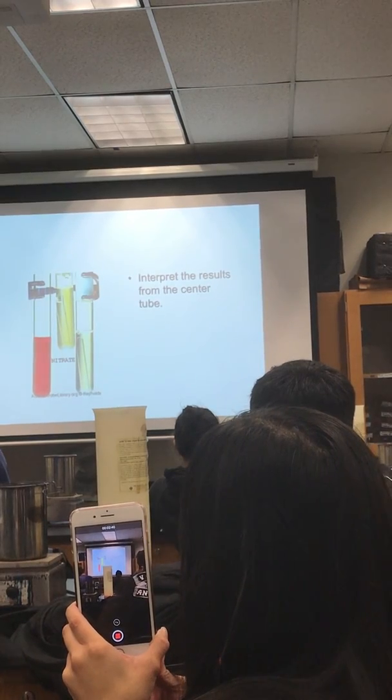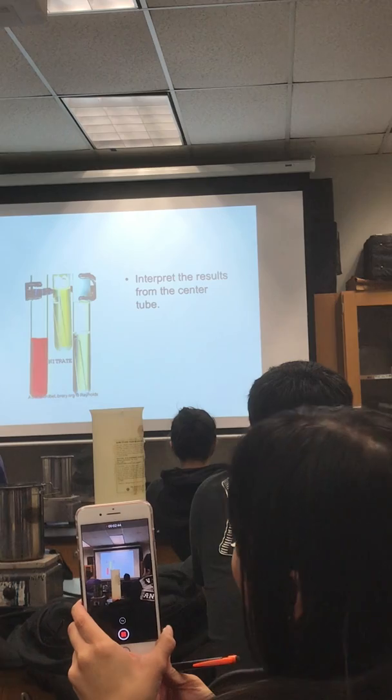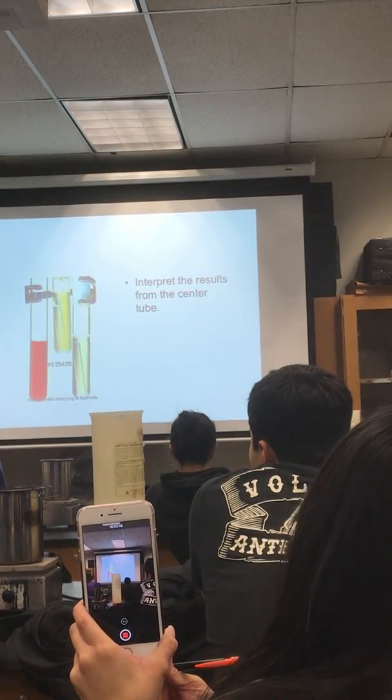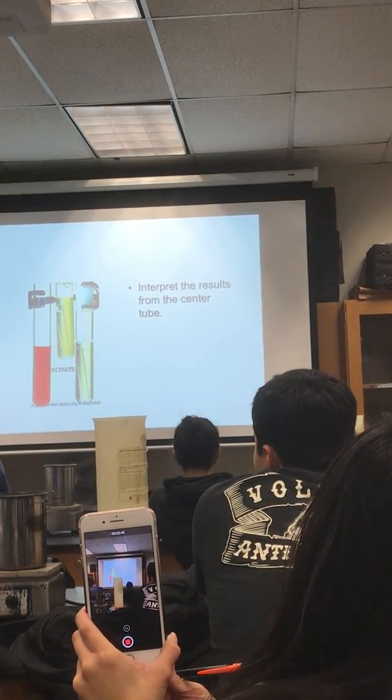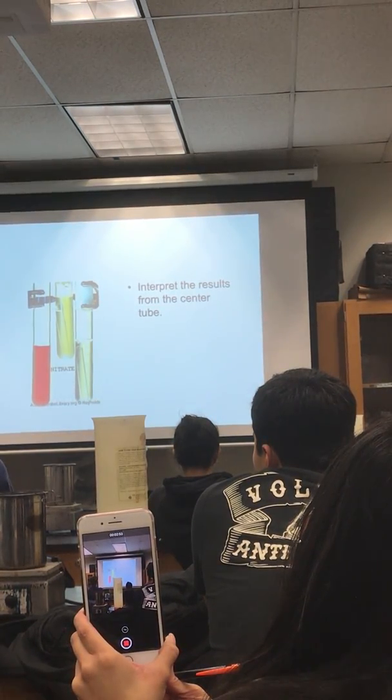So what is the center tube here? What is the center tube showing you? Positive. Positive for nitrogen gas. Okay? All right.